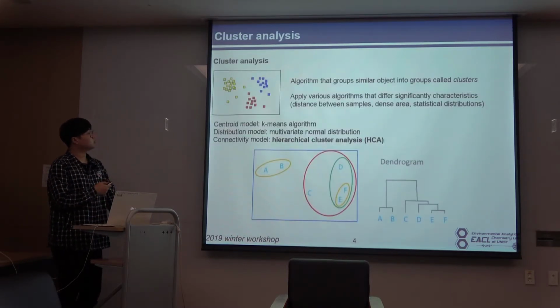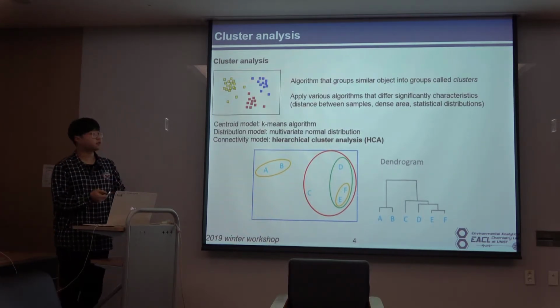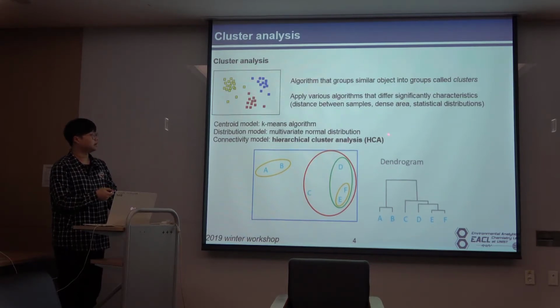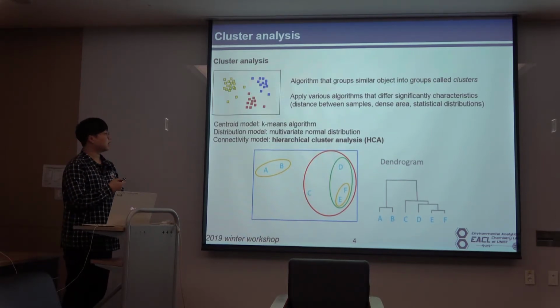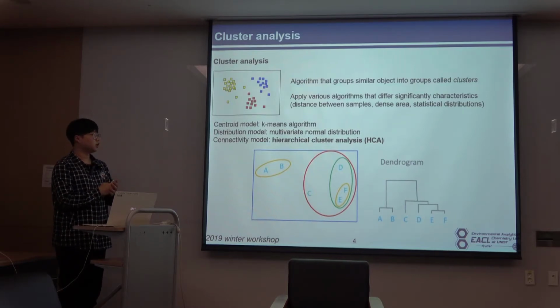Cluster analysis is just the application of an algorithm that groups similar objects. Based on the algorithm, there are many types of cluster analysis such as K-means or HCA. So I selected this connectivity model. HCA is the most easily understandable.